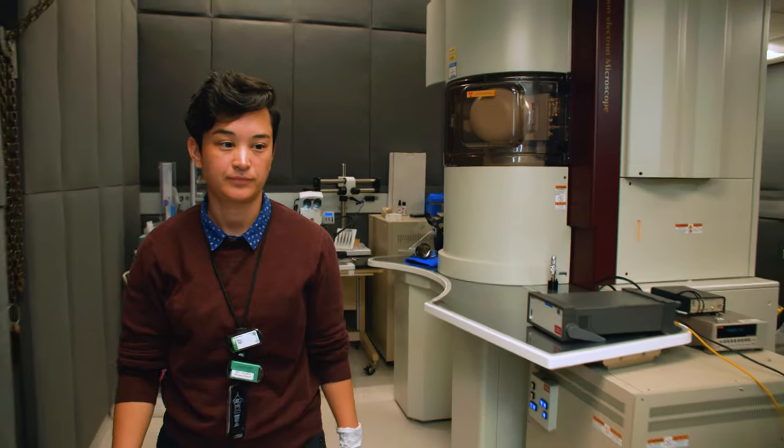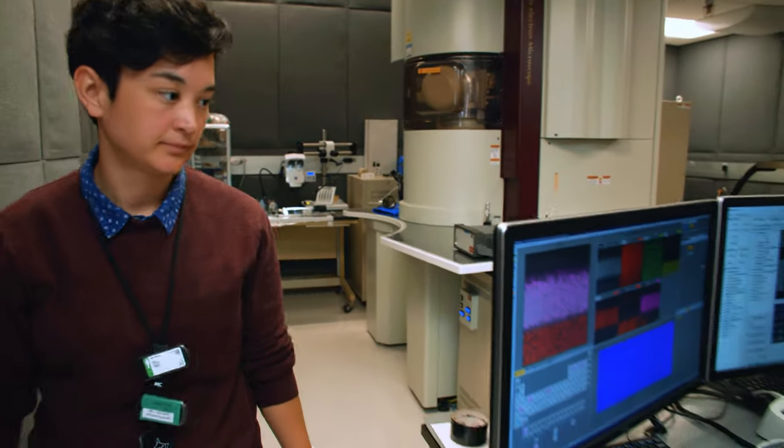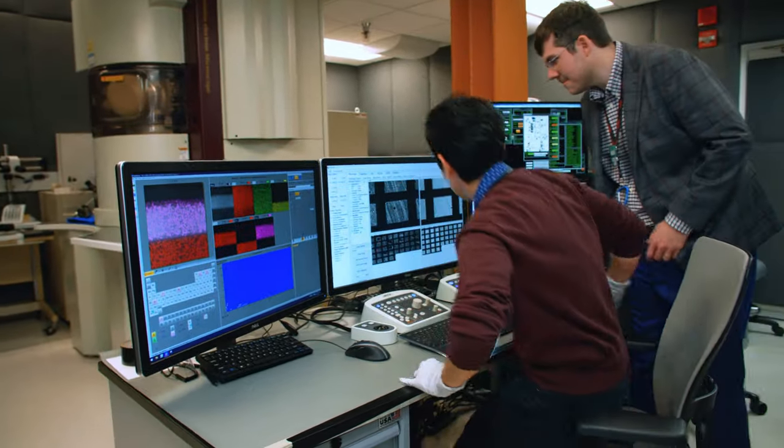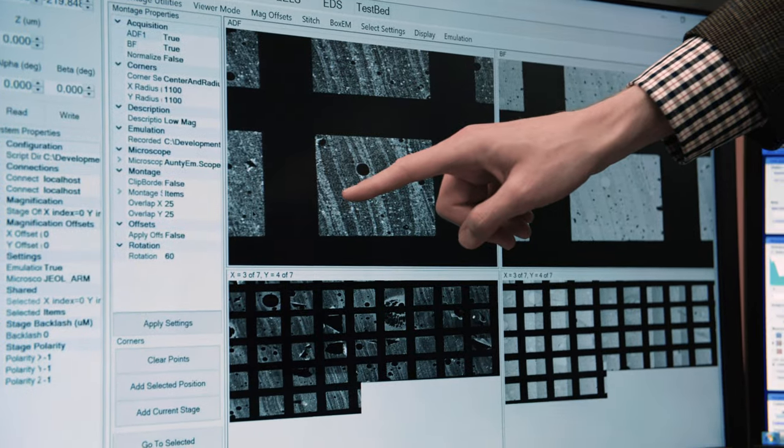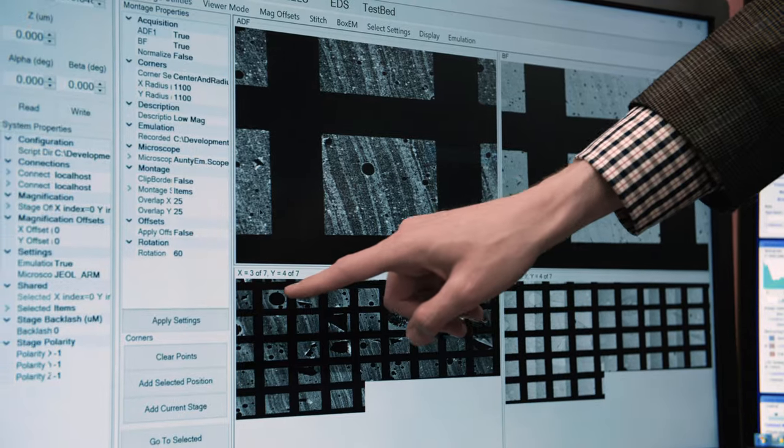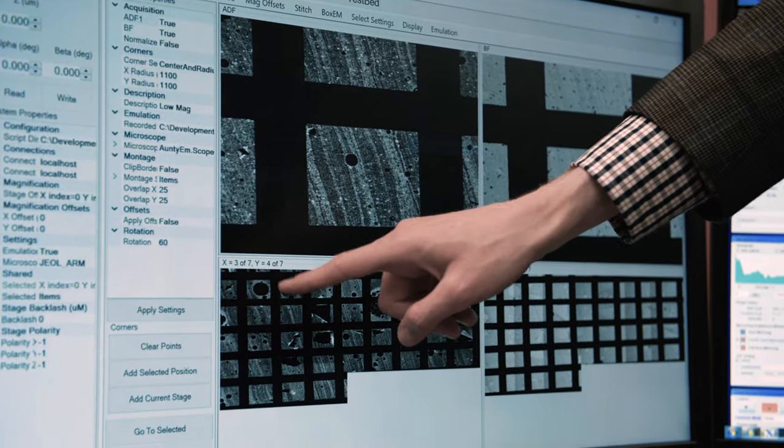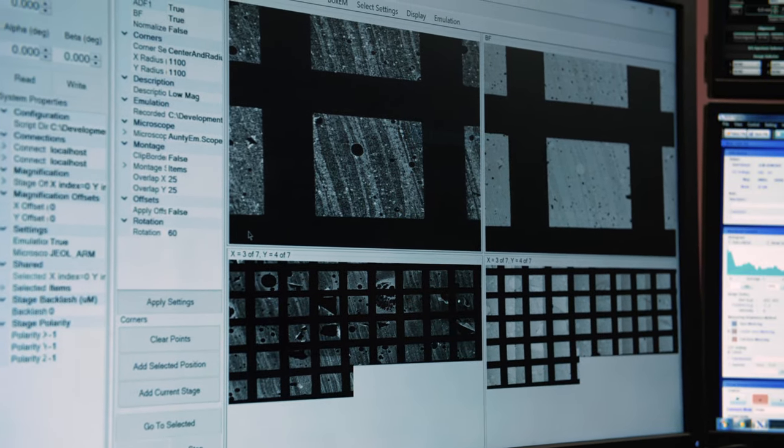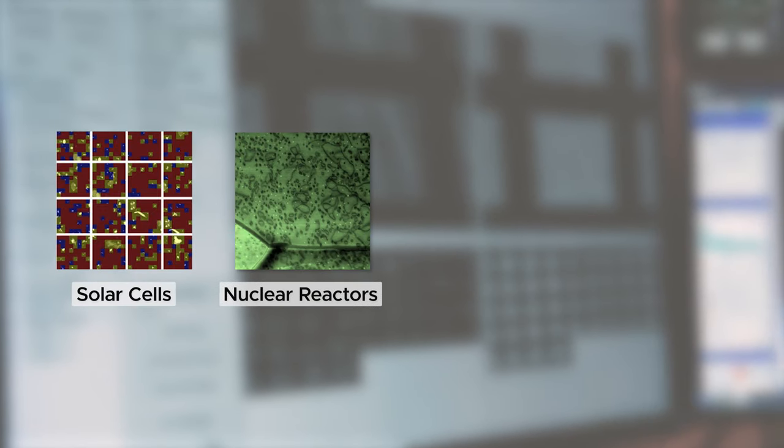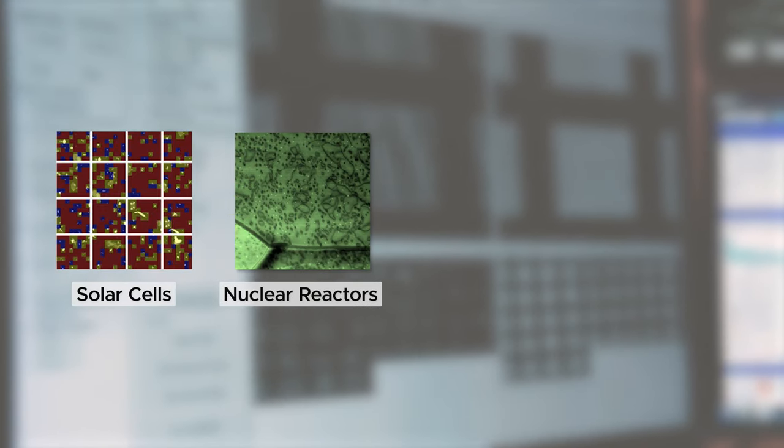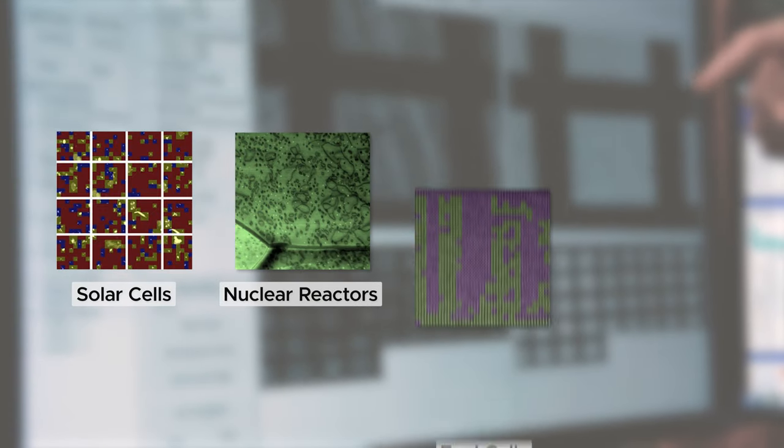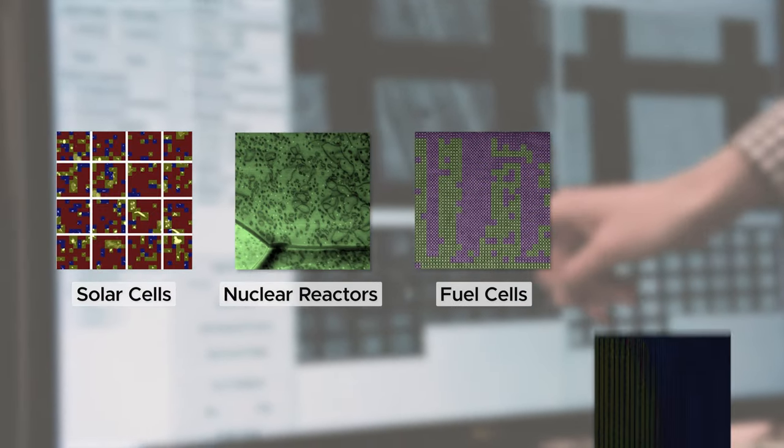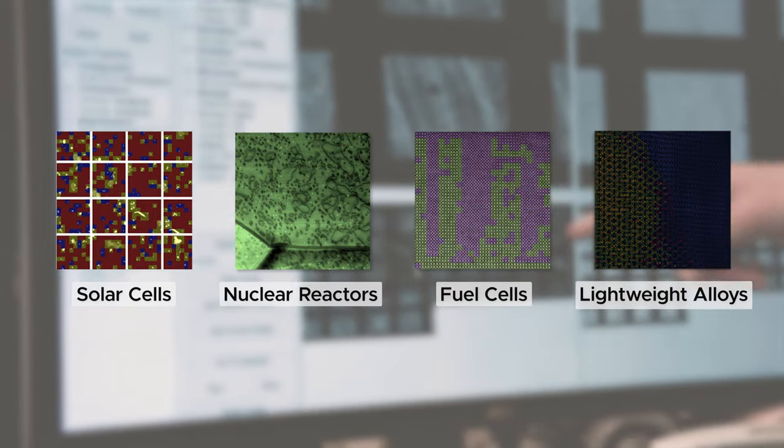With its remarkable capabilities, AUTO-EM is reshaping the study of materials and chemical systems. The platform is helping researchers better understand defects in solar cells, aging of nuclear reactor parts, breakdown of fuel cells, and the design of lightweight automobile alloys.